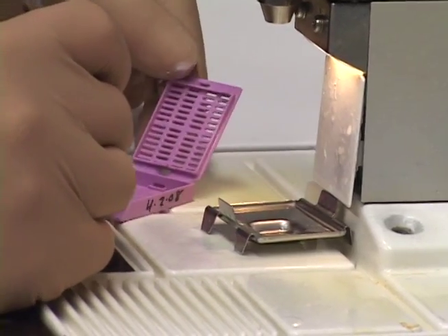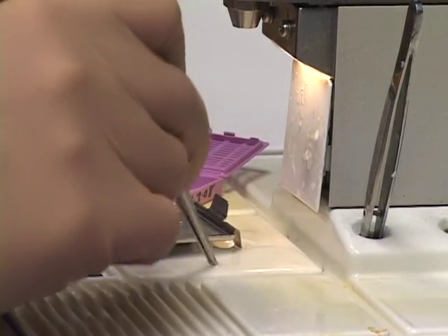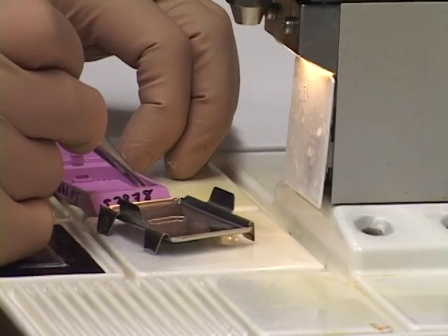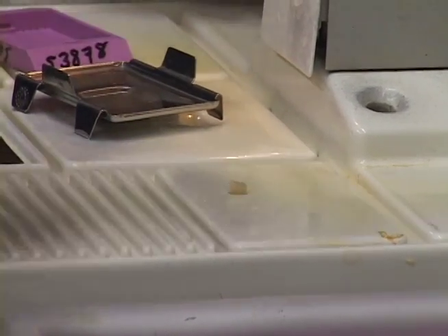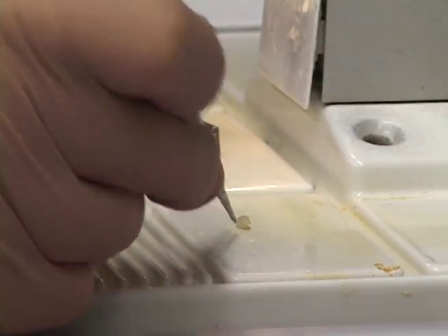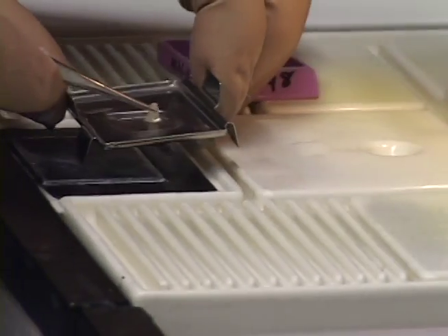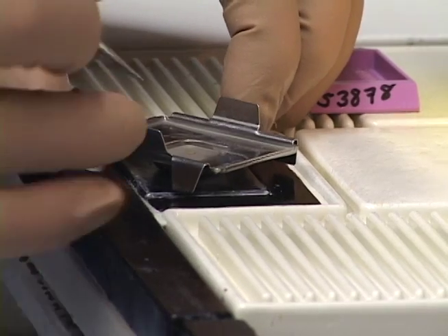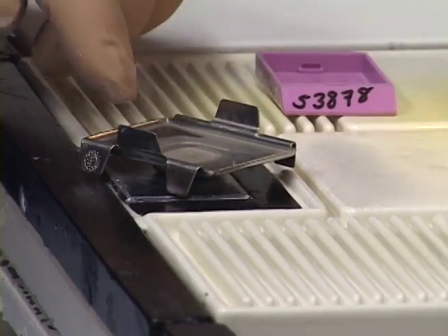I have one little testes sample and I'm going to embed it as a cross section. I put a little bit of paraffin in this mold and keep the mold on the warm area. I take the sample, get it orientated the way I want with my forceps, then bring it to the cold spot to create a small film on the bottom and hold it in place. Now it's nicely aligned as a cross section.